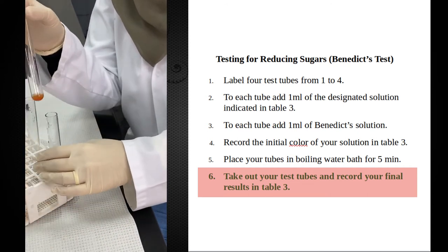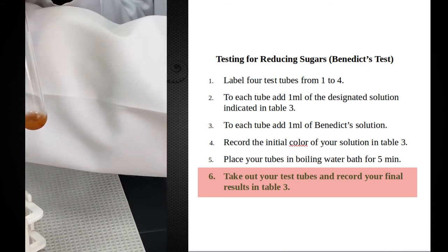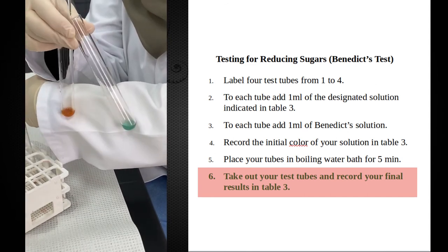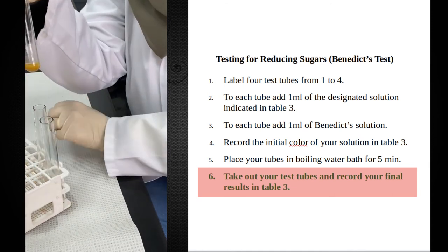The red precipitate can be seen in our positive control test tube. This is the glucose test tube, so it's very obvious the difference between a negative result and a positive result. We take a look at our milk results.